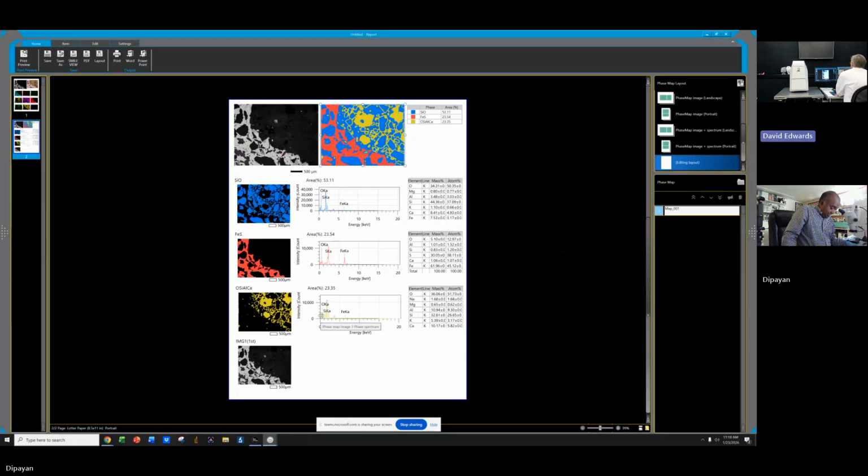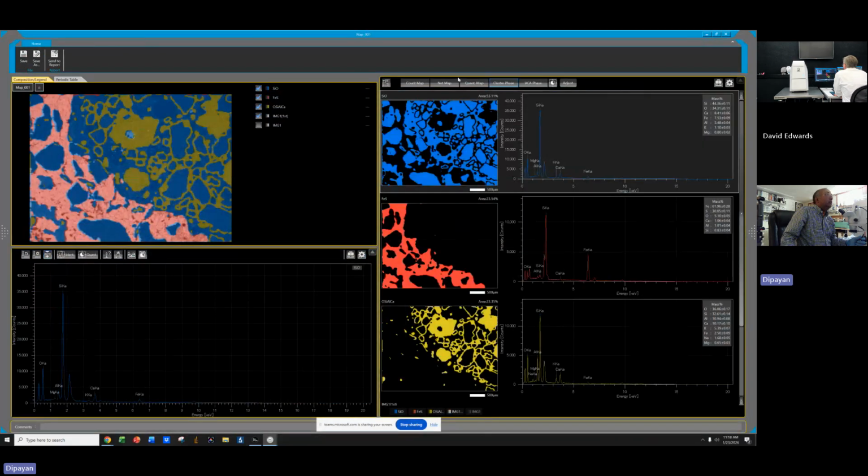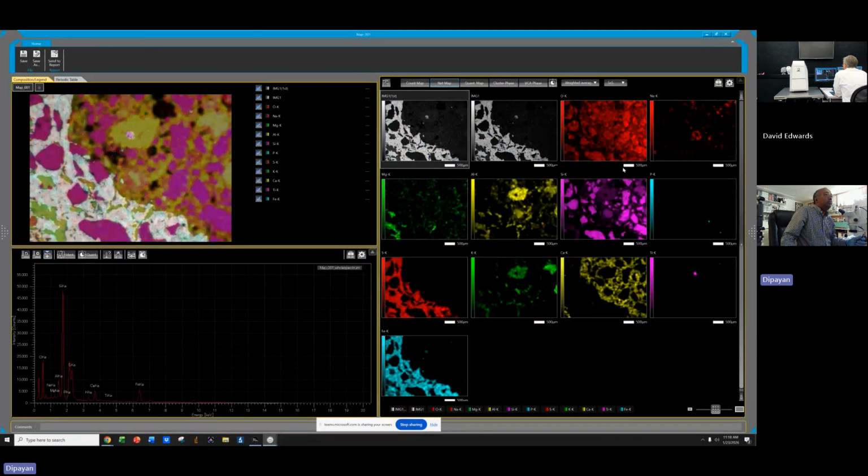If that's what you were going to do, I would create a template, because you can't make the other ones disappear, but you could put them on a second page. Shrink this.